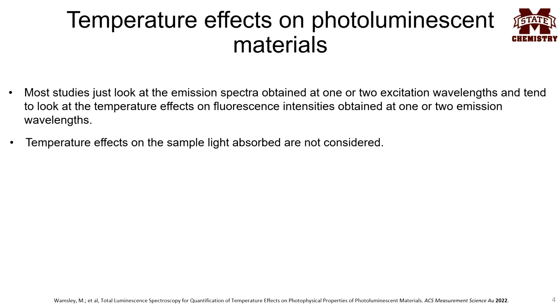Secondly, the temperature-induced emission intensity change has been attributed to the variation in just the fluorescence quantum yield, and the temperature effects on the sample light absorbed are not considered.